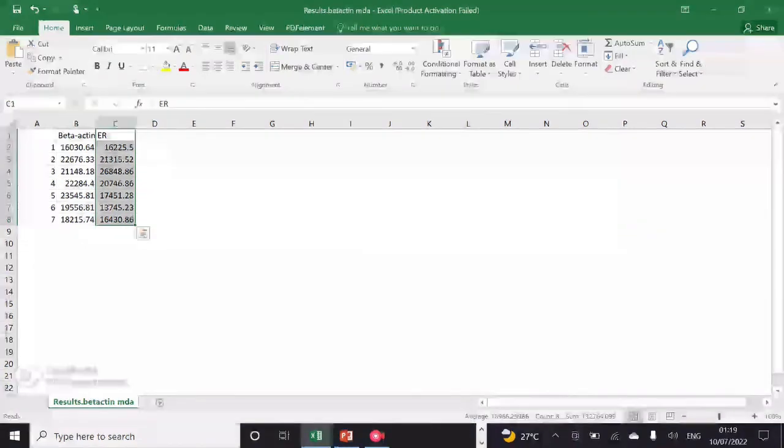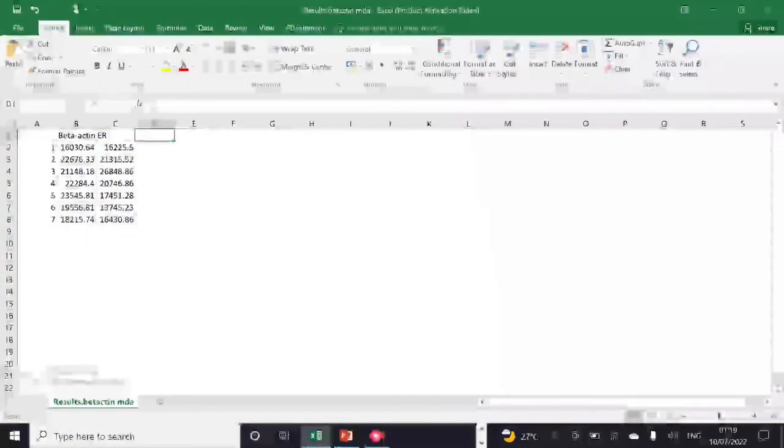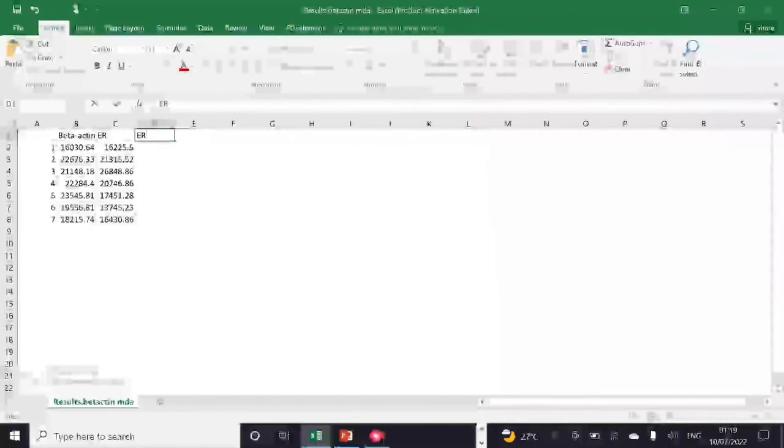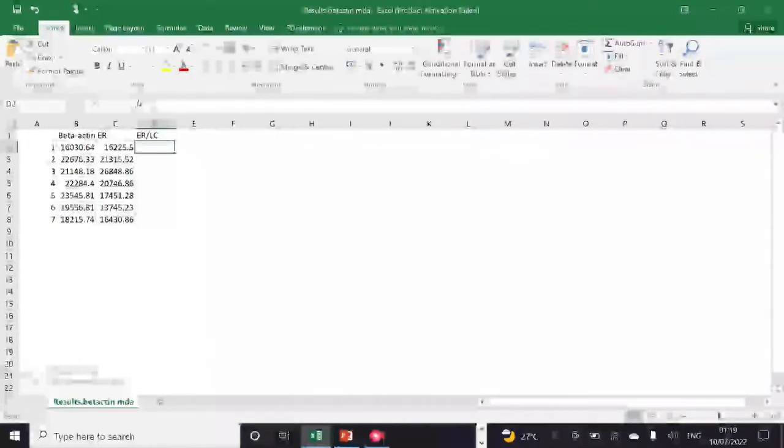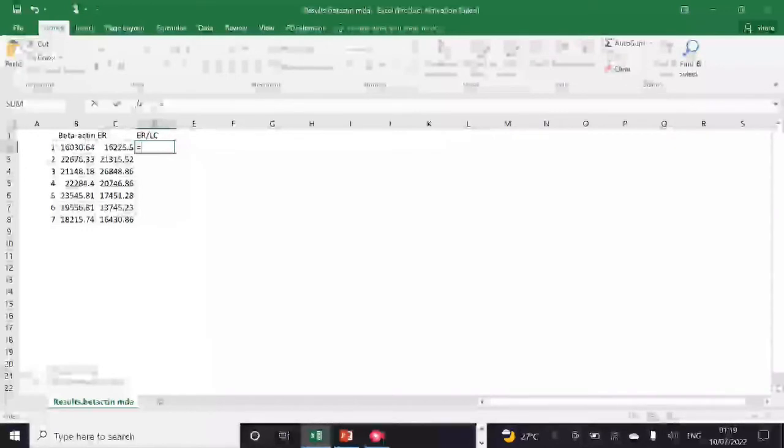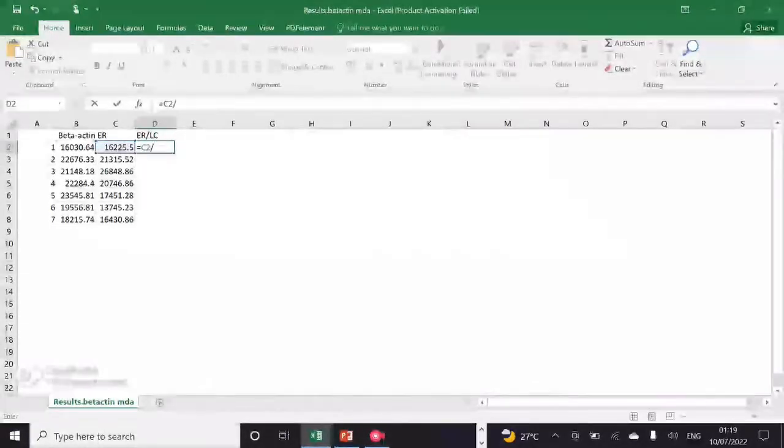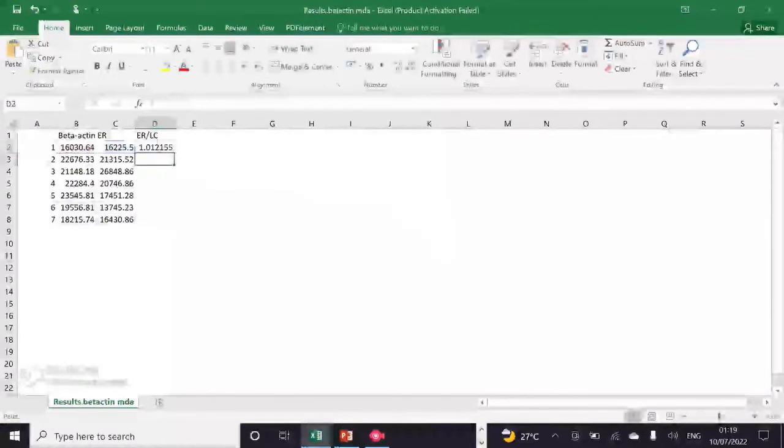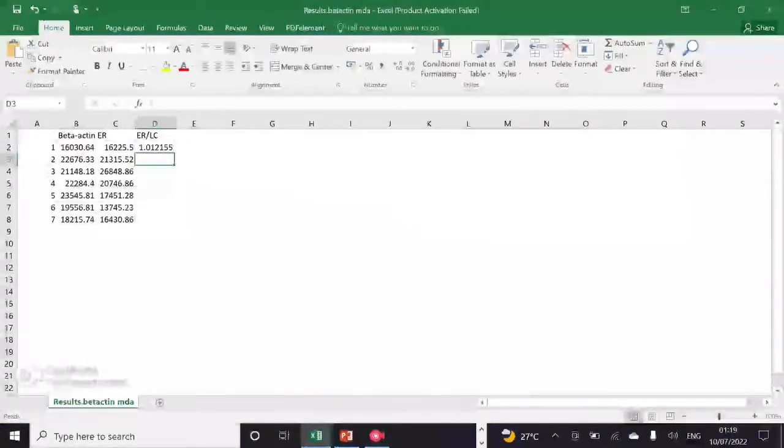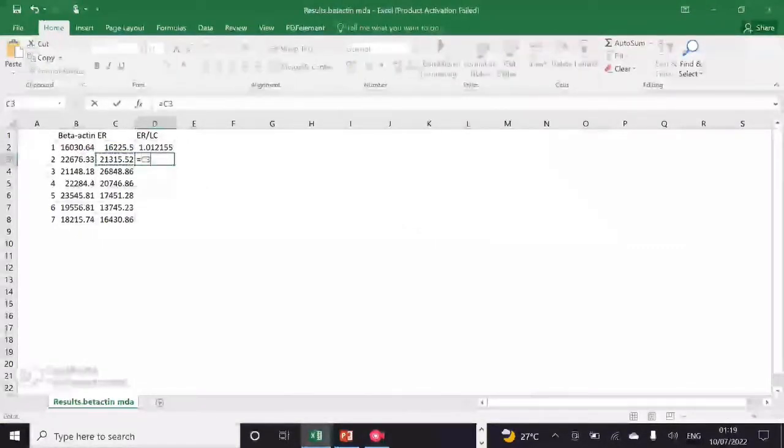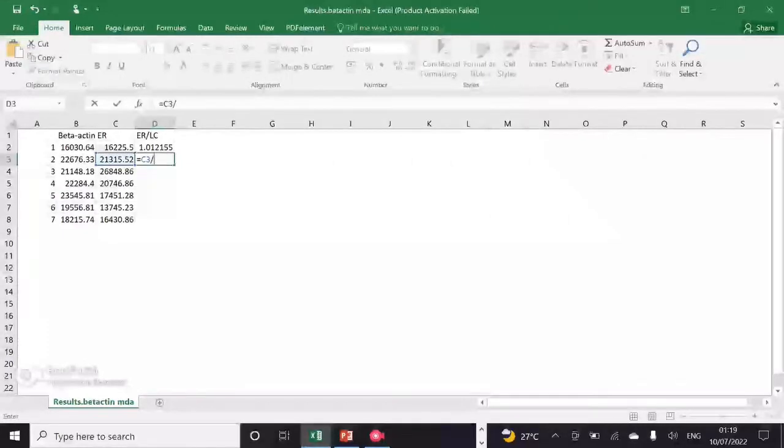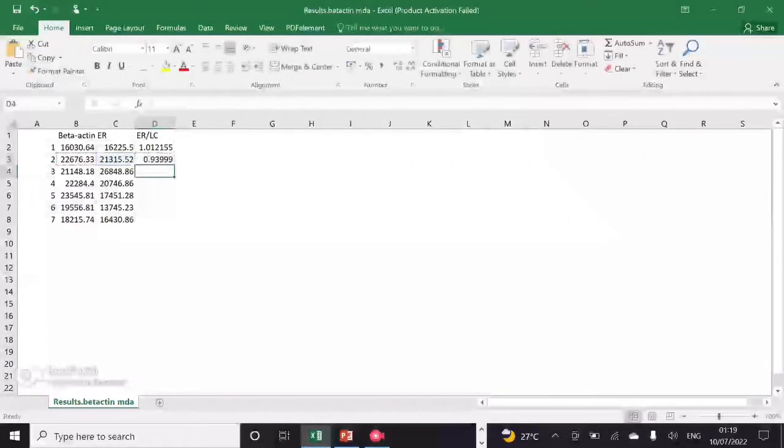Hello everyone, I am here today with the second video regarding Western blot quantification. In my previous video, you all saw how I showed you to obtain the values of your protein bands from ImageJ. In this video, I will show you how to further analyze your data obtained from ImageJ.